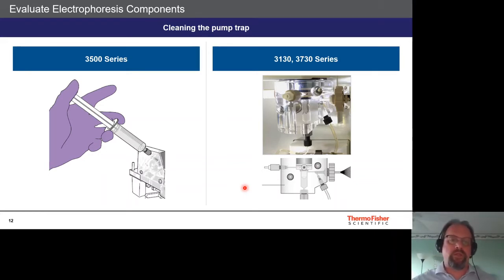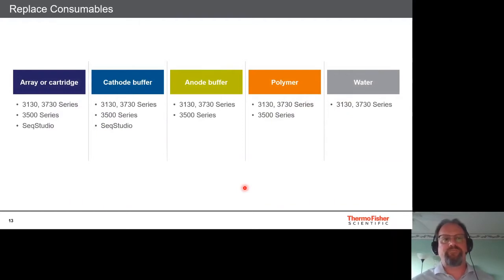Now with the instrument clean and a new or good array reinstalled, replace all the other reagents: new array or cartridge, new cathode buffer, new anode buffer, polymer for non-SeekStudio instruments, and fresh water for the 3130 and 3730. For the SeekStudio, no manual PDS washes are needed — the cartridge automatically performs a thorough washing of the entire PDS system the moment it is inserted into the instrument.